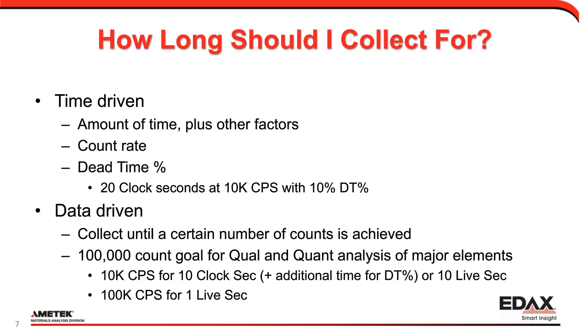For those experienced microanalysts out there, you might be saying, I know that there is actually something changing between 10,000 counts per second and 100,000 counts per second. And that's the concept of amp time and dead time. We are, in fact, speeding up our processor in order to be able to work at 100,000 counts per second. What I'll explain momentarily is how we can now do that with the latest silicon drift detector technology with very little trade-off.